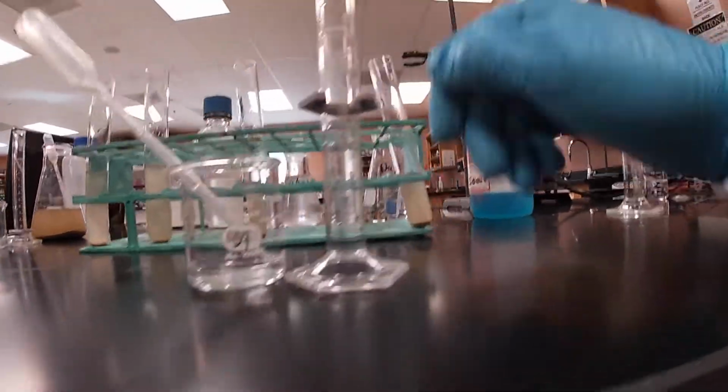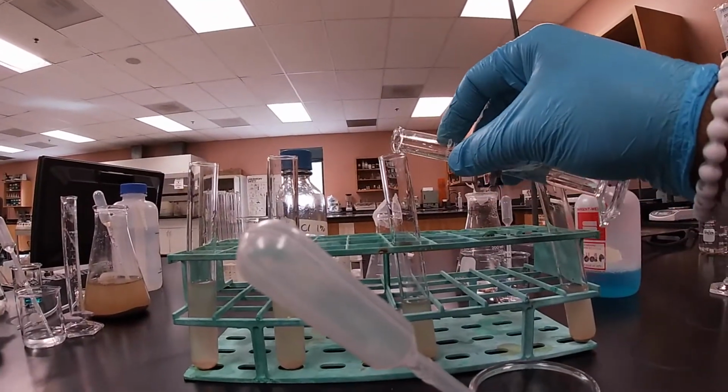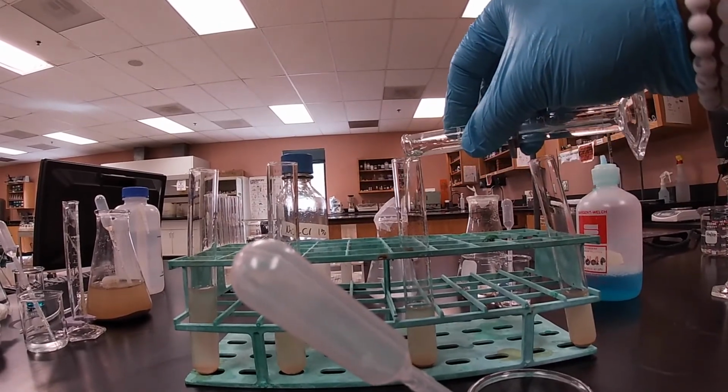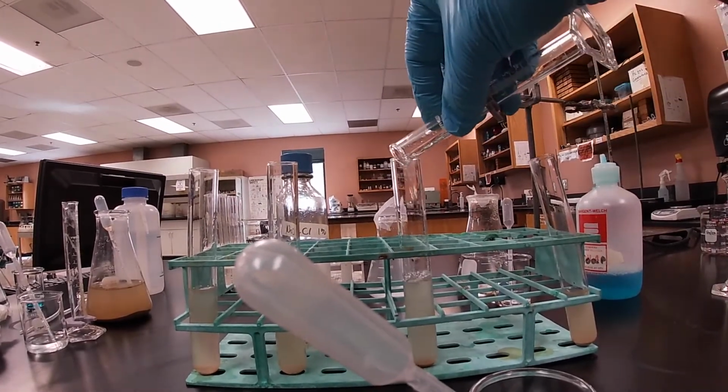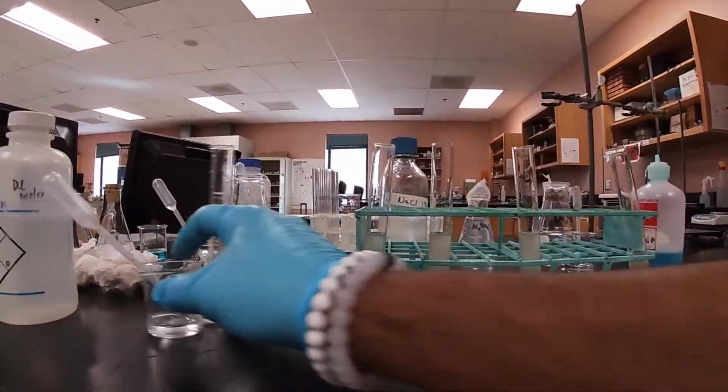Let's go ahead and check. Yeah, we're good. So 5 milliliters of our aluminum sulfate into our third container. We'll set this on the side.